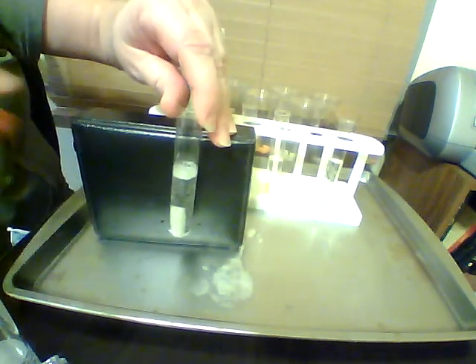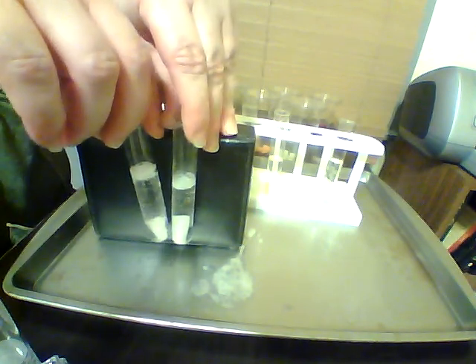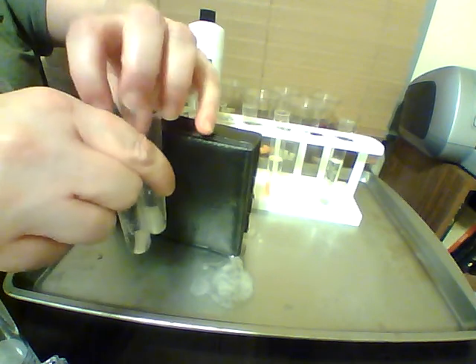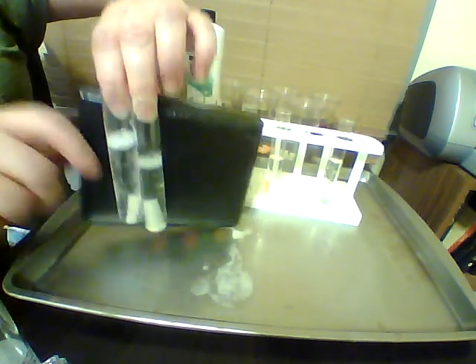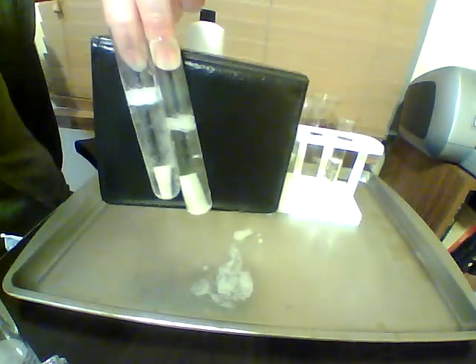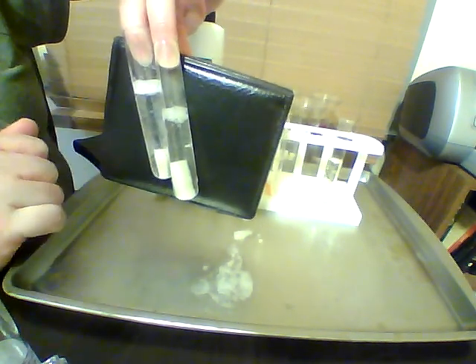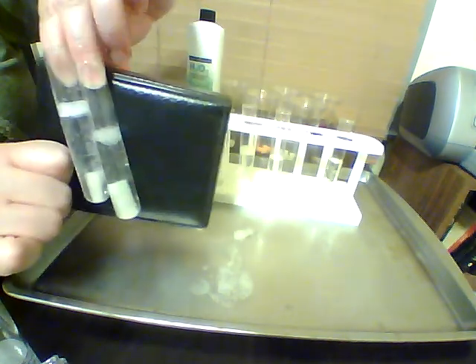And for our potato, here's our raw potato versus our cooked potato. Again, maybe I should have cooked my samples just slightly longer, but you can see that there's much less. This is a much thicker foam in here. There's much less bubbles, so the reaction has been reduced.